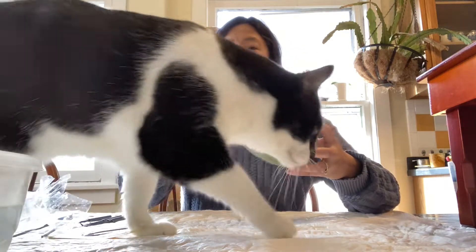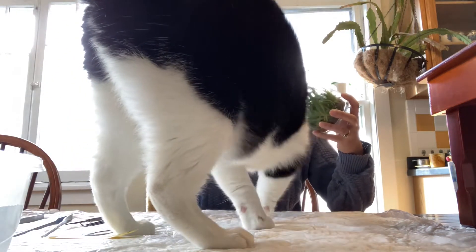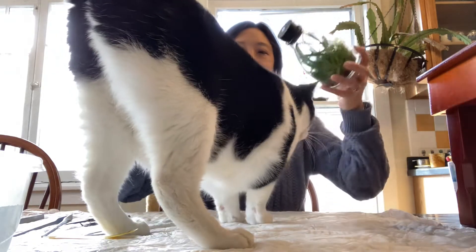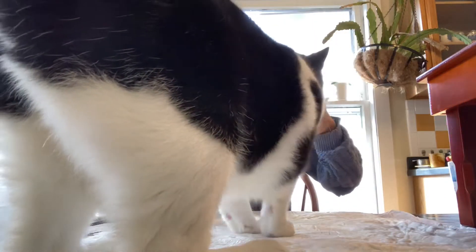This is going to be hard enough as it is without you. Let's take out the cork — completely.